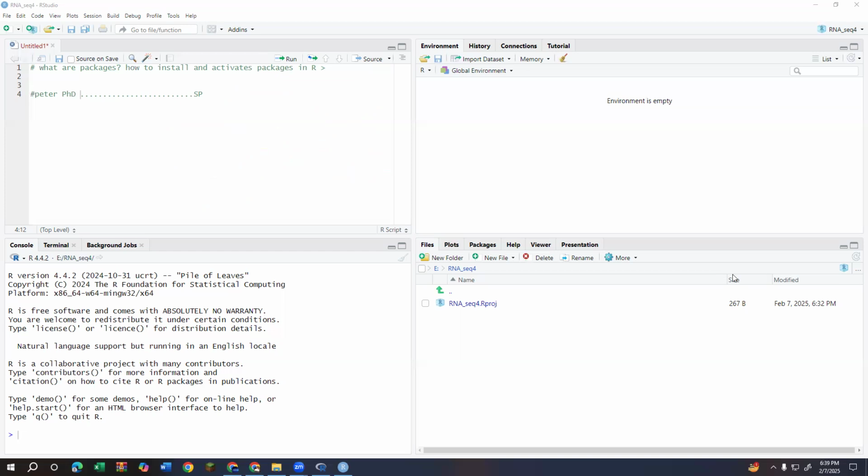In our daily life or in our lab, we call these tools instruments, machines.